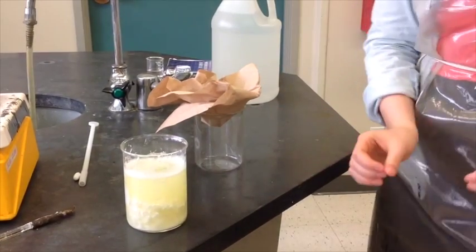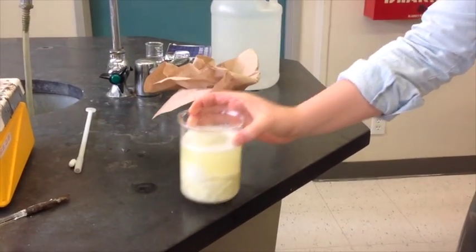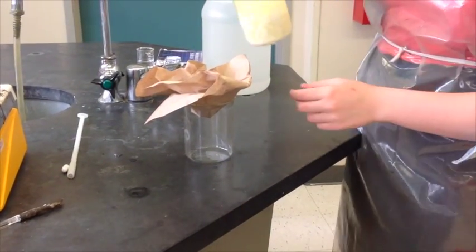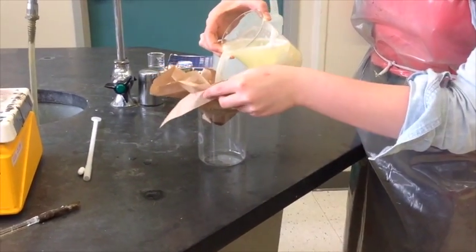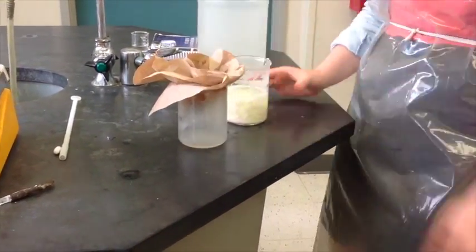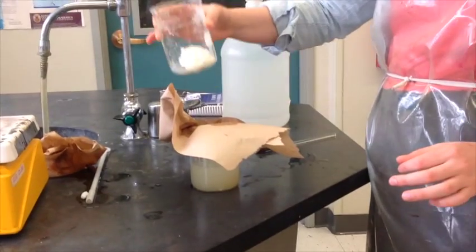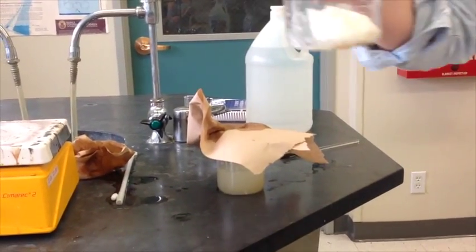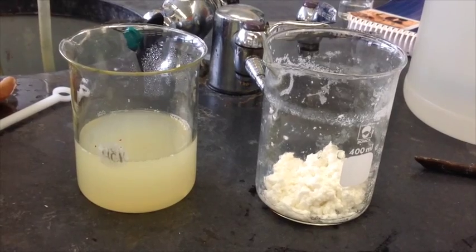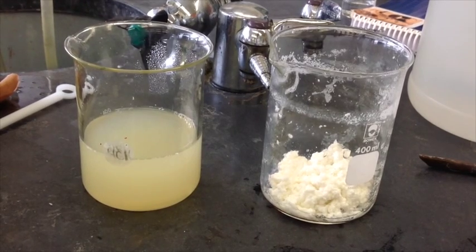Step 3: Now that you have extracted casein from milk, we are now going to drain out the excess of non-protein milk using a paper towel and a beaker. On the right is the casein, on the left is the liquid leftover from the milk.